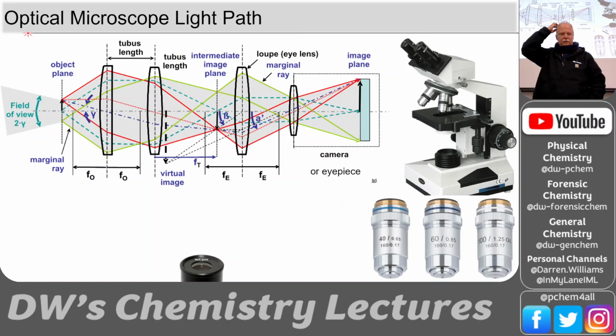So this is a very simple version of a microscope. This has only got 4 optical elements in it. Many of them are more complicated than this, but this is a decent image of what's going on inside the microscope. So we have down here the object plane.